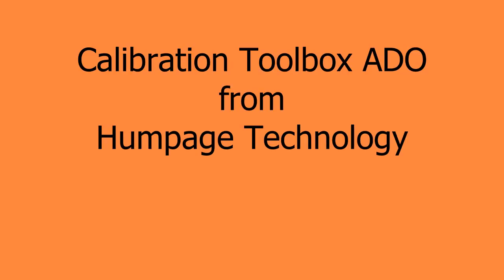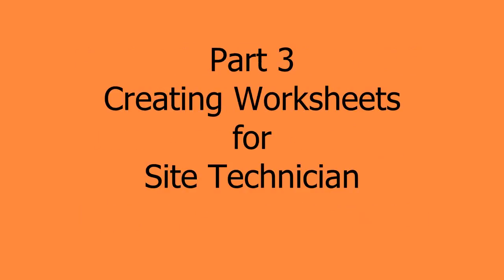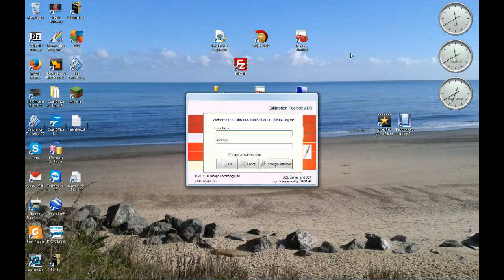Calibration Toolbox ADO is unique amongst calibration management systems, and one of the reasons for this is the fact that it's developed by people who understand the calibration process and the diverse number of ways in which you're going to have to work in order to acquire your calibration data, both off-site and on-site. So today what we're going to do is introduce to you the concept of the site technician, which enables you to either work in your own laboratory or on a customer's site to perform your calibration work.